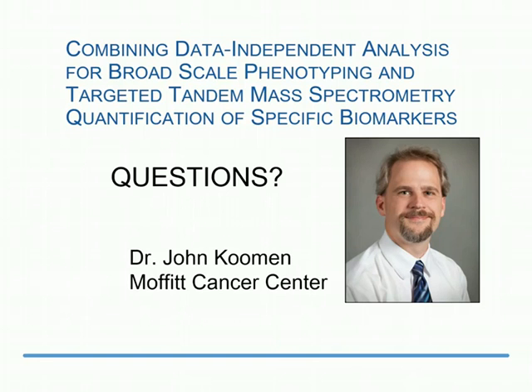And then when you go into a data independent analysis strategy, you have to set some area of space that you're going to sample from the intact peptides, and that has to be based at least in part on the complexity that you expect for that region. So when you have lower mass to charge value, we tend to see a lot more peptides, and so we use a narrow window there, 5 usually, or 7. So if you wanted to look at things that were around 500, you would select from, say, 500 to 505. The next window would be 504 to 509, and so on. So you have a small overlap between the different windows.